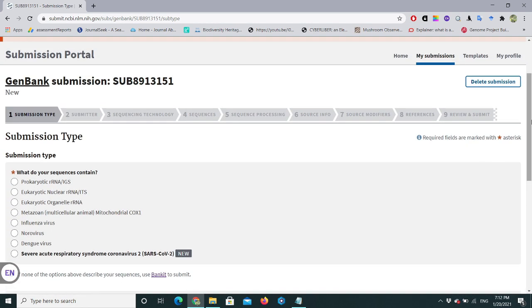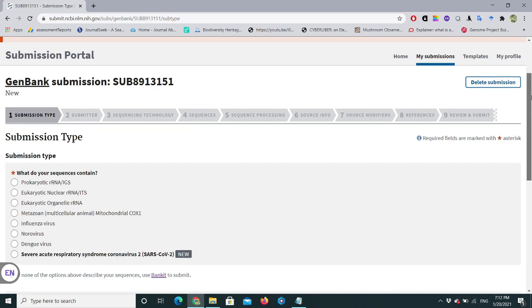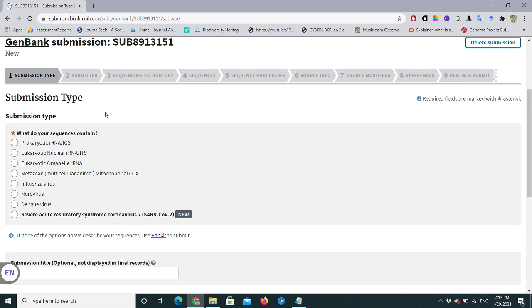This is the actual interface of GenBank. Our submission ID is SUB8913151. This first page is very important — it is the Submission Type page. NCBI will ask you some questions about your sequence. What do your sequences contain? My sequence belongs to eukaryotic rRNA ITS, so I'll select 'Eukaryotic nuclear rRNA ITS'.